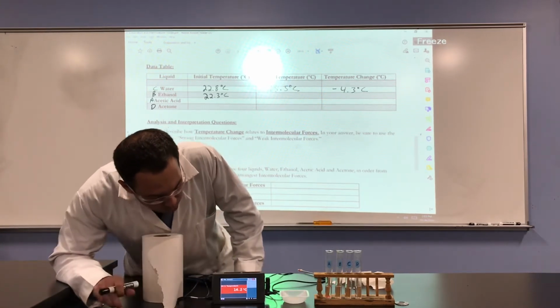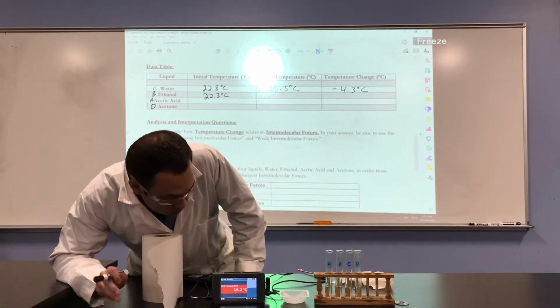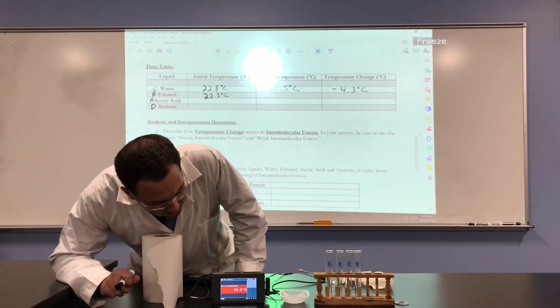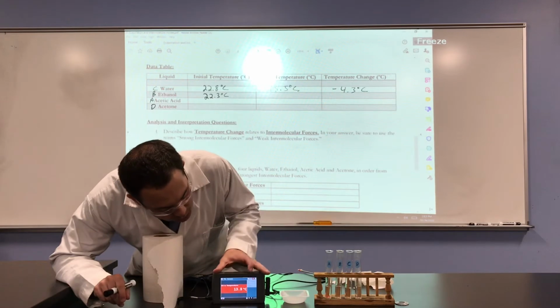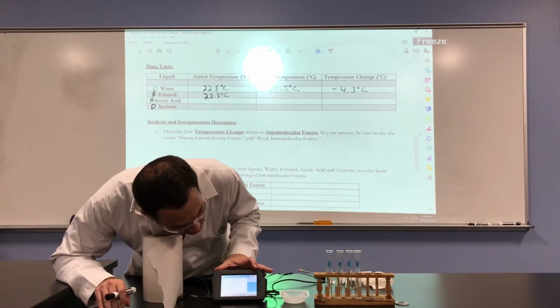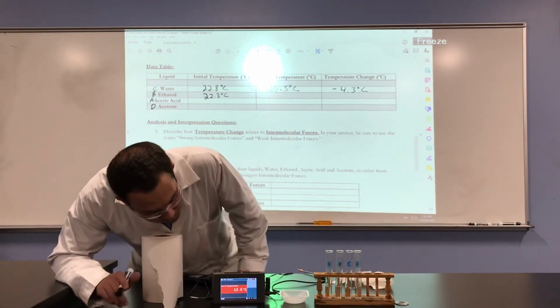We're at 14.3, 14.2, 14.2 again. Now fluctuating around, I saw 13.9, 14.0, 13.9. Seems like we're leveling off. We're probably close. So we're 90 seconds, about halfway through our timer.